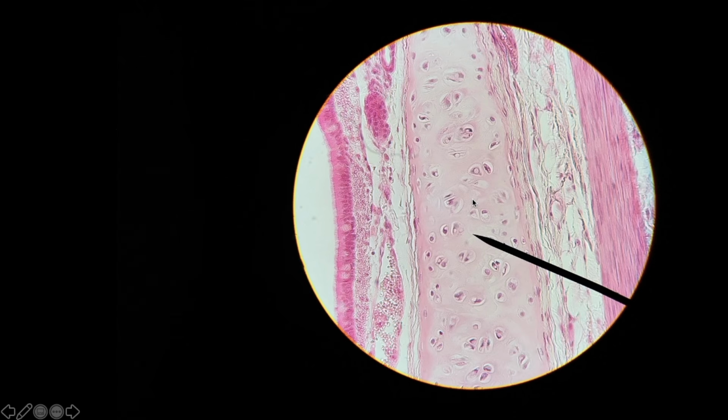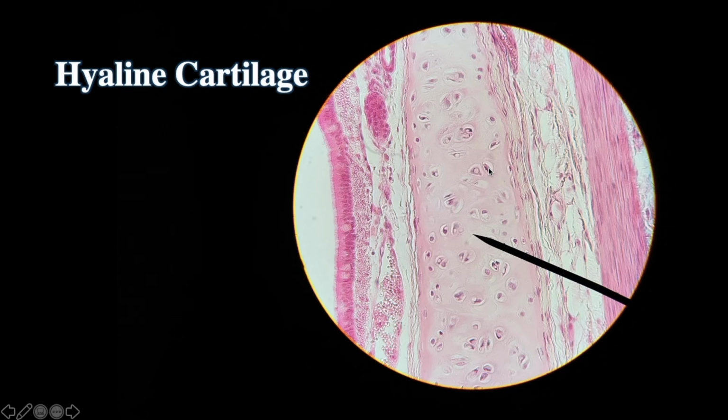This is hyaline cartilage. Now, the nuclei that you see here are not nuclei. The pink dot that you see in each of these white things, those are actually the cells. And the white that you see around is the lacuna. Lacunae. So one is lacuna. What is the lacuna? It's the home of the cell. What is the name of this cell? Well, this is cartilage, so this is a chondrocyte. Chondrocyte inside of the white little home called lacuna. This cartilage here is called hyaline cartilage.